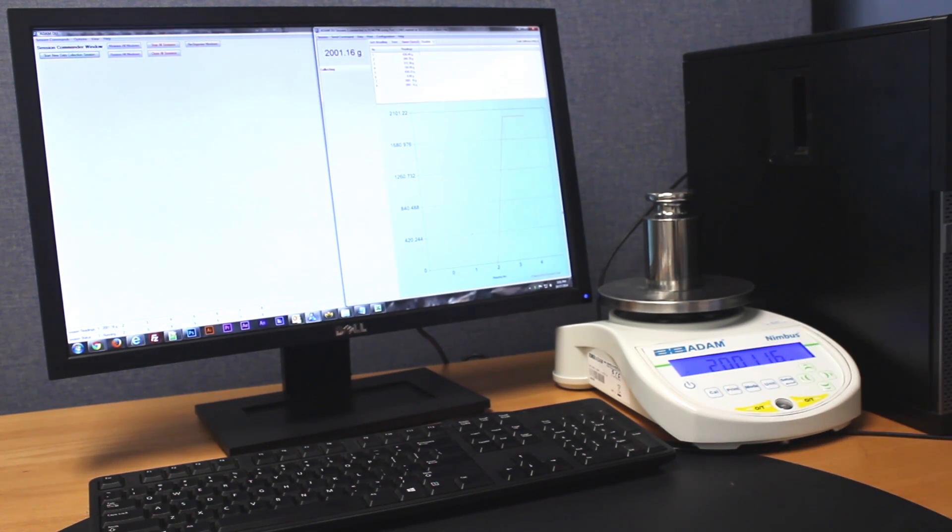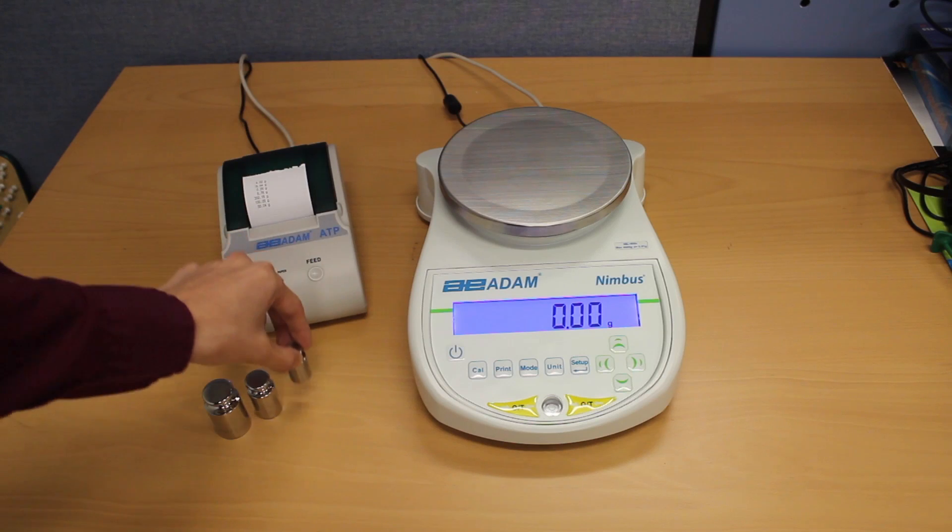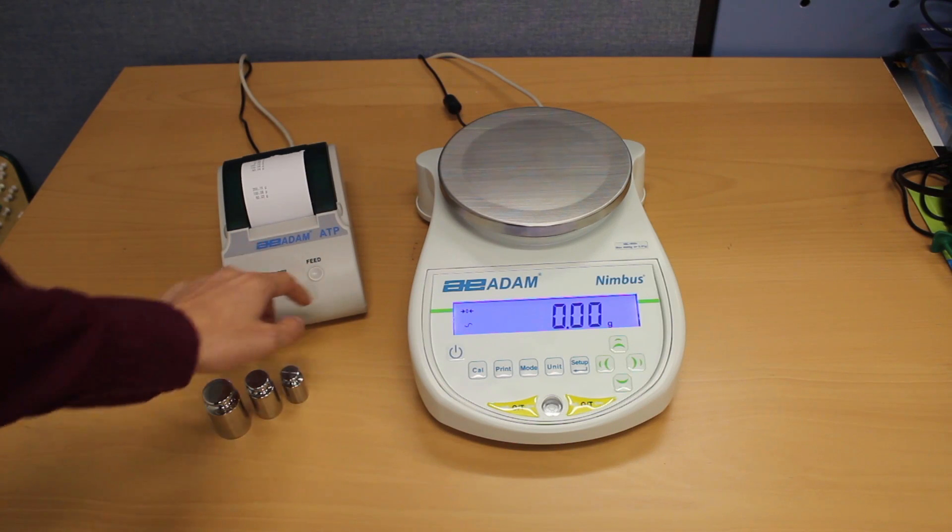Adam DU can be installed on your computer to receive readouts from Nimbus. All data conforms to good laboratory practices.